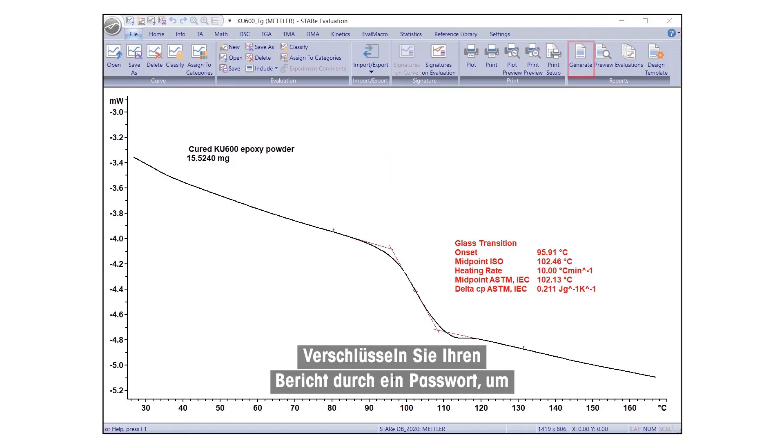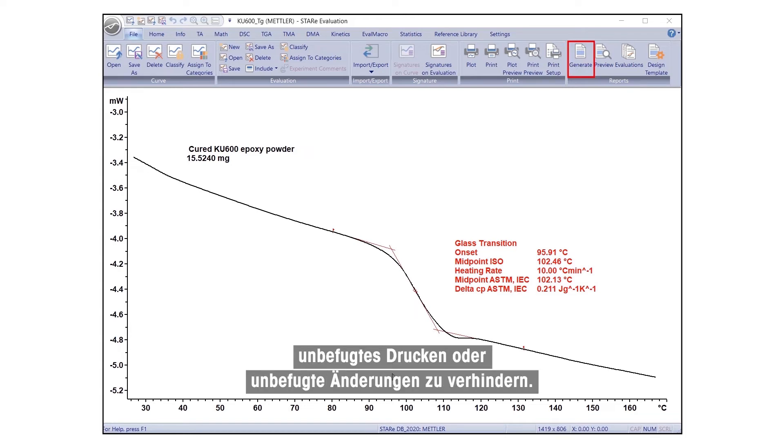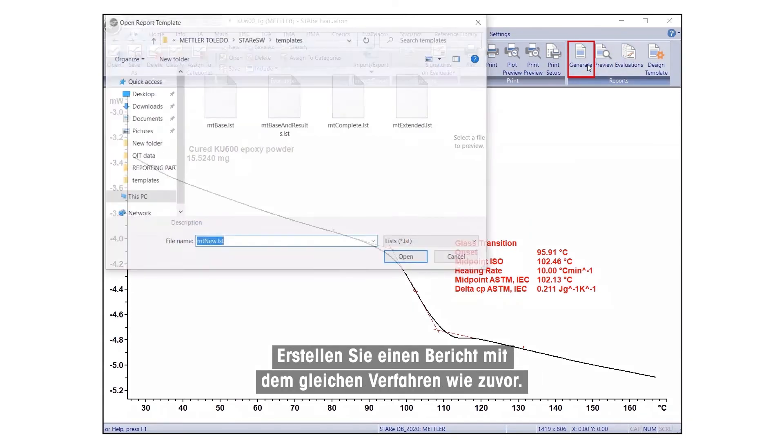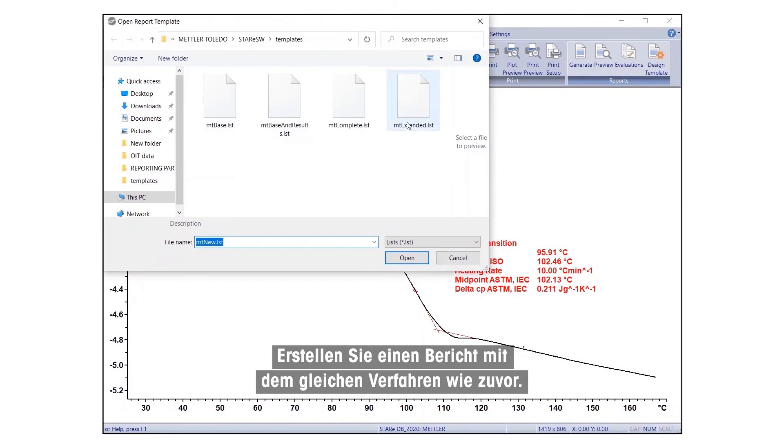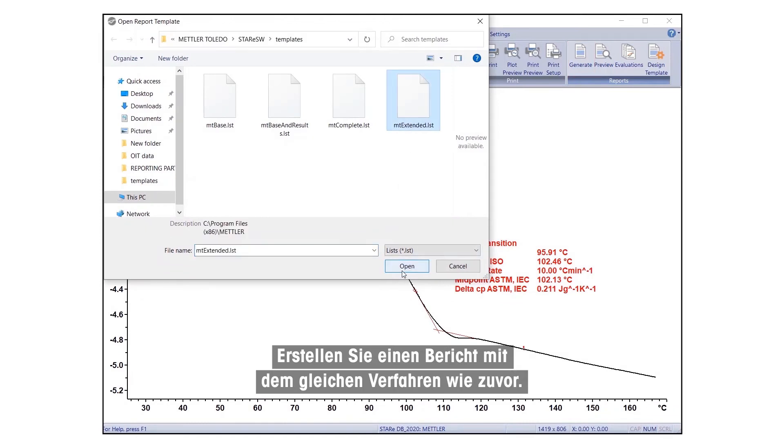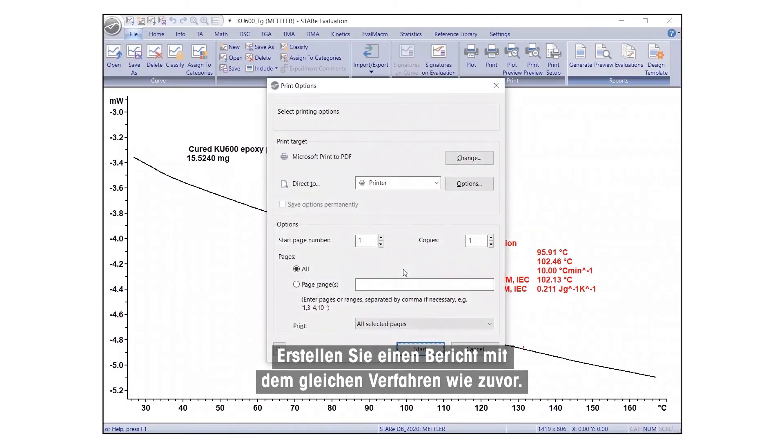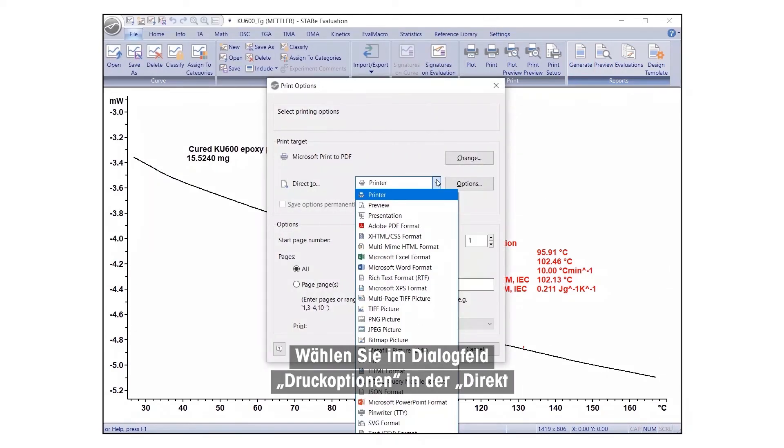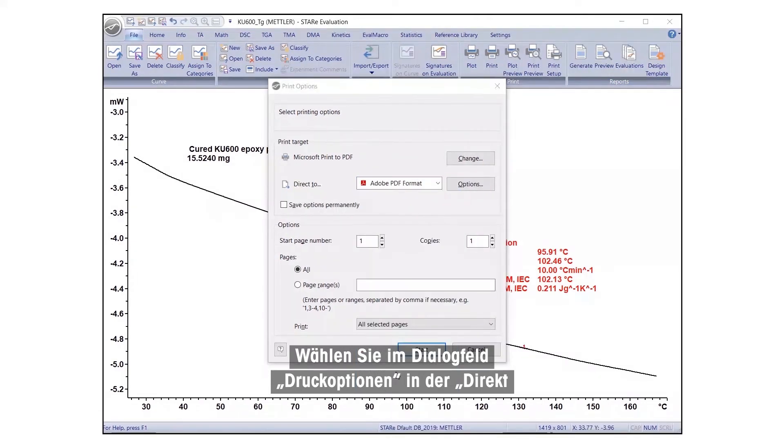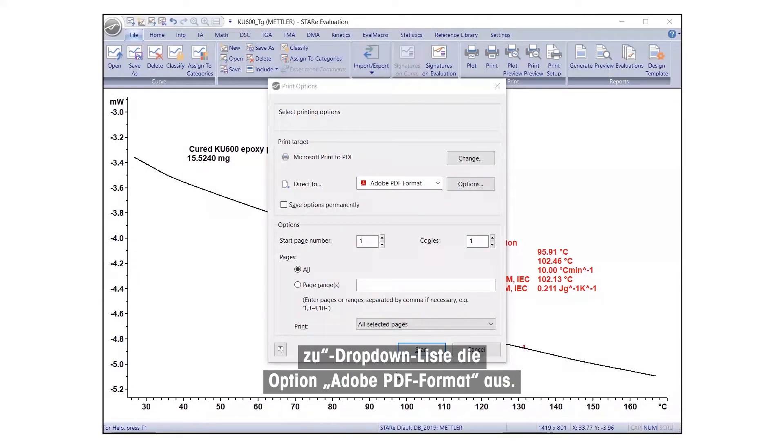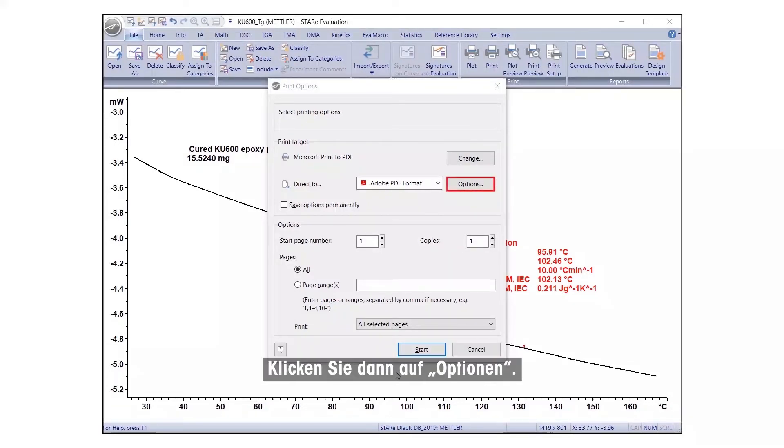Encrypt your report with a password to prevent unauthorized printing or modifications. Create a report using the same procedure as before. In the Print Options dialog box, select Adobe PDF format from the Direct To dropdown list, and click on Options.